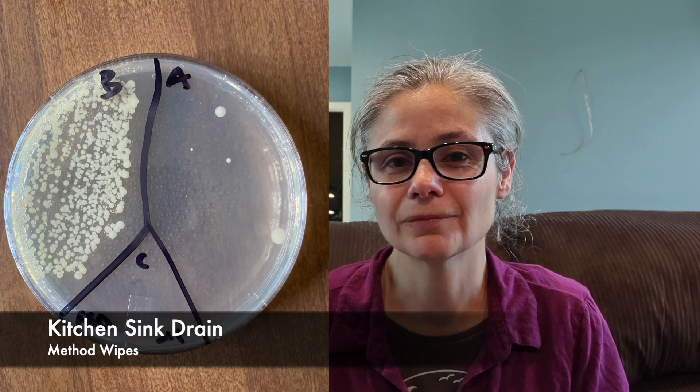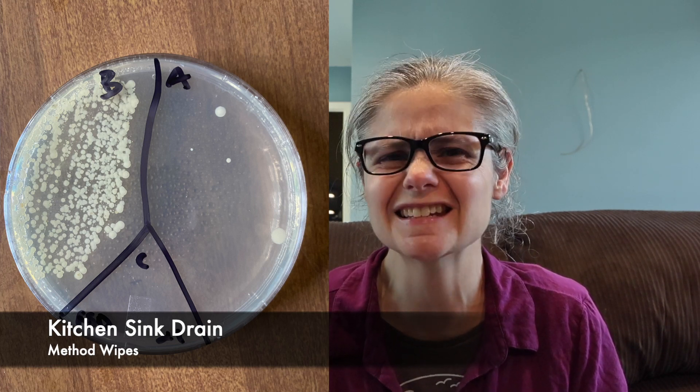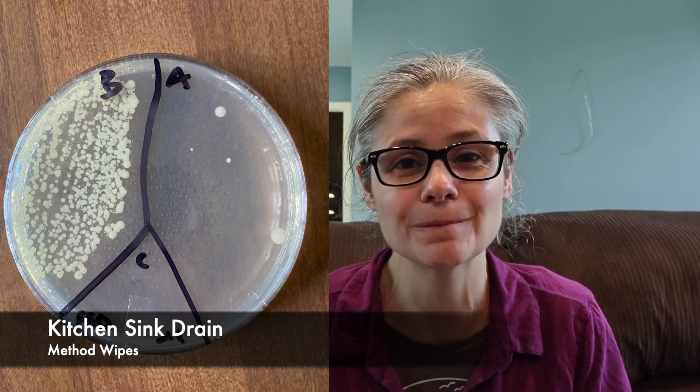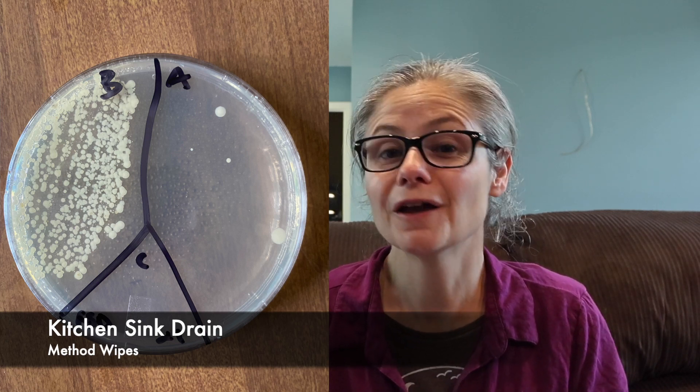The kitchen sink drain: in the before section, we can see a lot of bacteria there — that's a ton of bacteria in the kitchen sink drain. And in the after section, I counted only four bacterial colonies growing. So the Method wipes did an excellent job at removing bacteria from my kitchen sink drain.